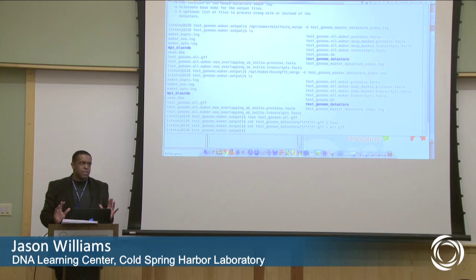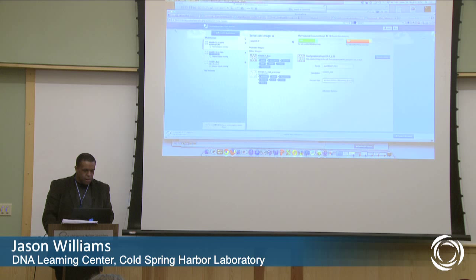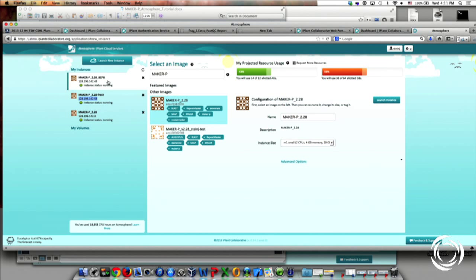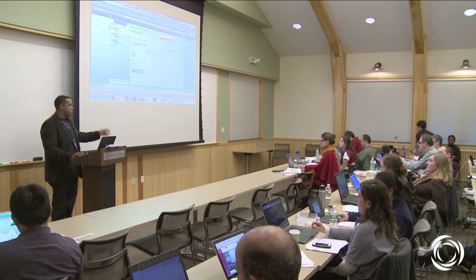Right now you're using these virtual machines. Let me close VNC Viewer. Even though I quit VNC Viewer, that does not shut down my machine. You actually need to select your machine that you're working on, and once you select it, you have the option to terminate it. Unless you're going to be continuing with the tutorial, we ask that you terminate the instances so that those resources are returned to people doing real annotations and real science right now.